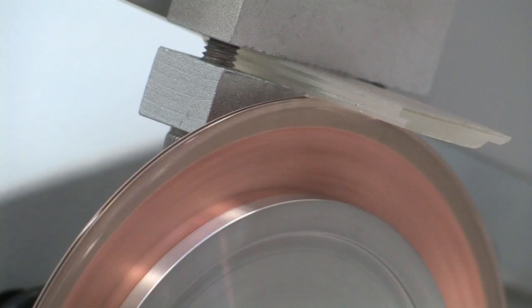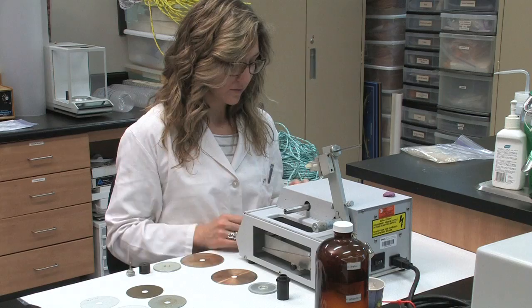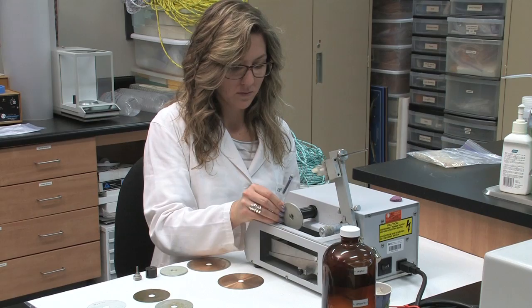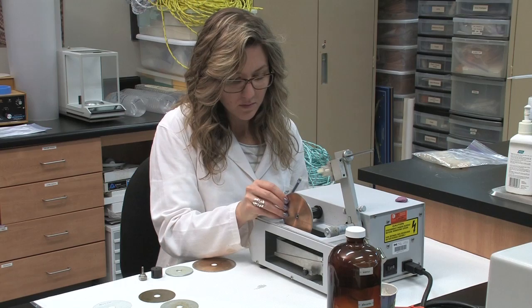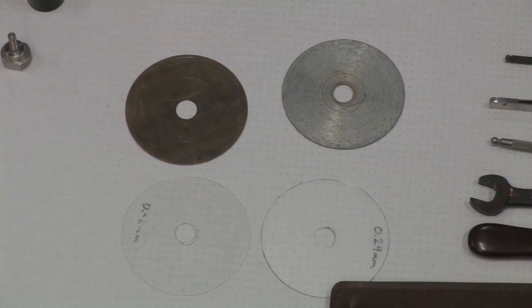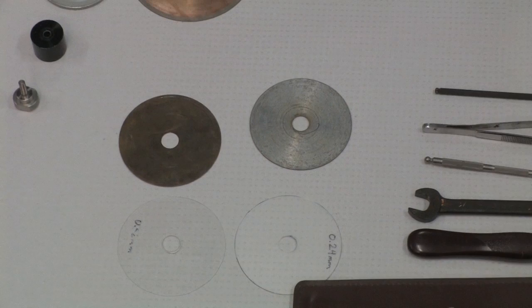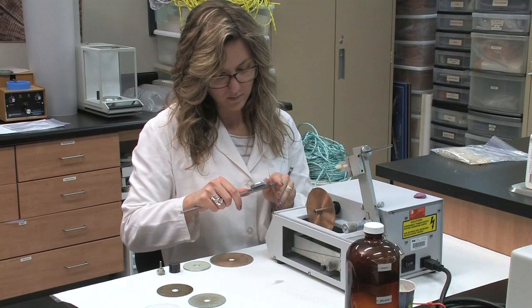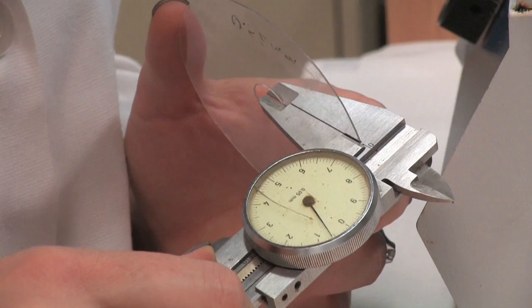We use a Bueller isomet low speed saw with a diamond edge wafering blade to make sections through embedded otoliths. The saw is assembled by placing the large black cylinder with o-ring on the cutting armature, followed by the blade keeper, the large round silver disc. Next we install the blades. Spacers are used between the blades to determine the thickness of your final section. The spacers are mostly made from scrap plastic of varying thicknesses, cut from thin sheets of brass or old blades, and the spacer's thickness can be measured with a set of calipers.